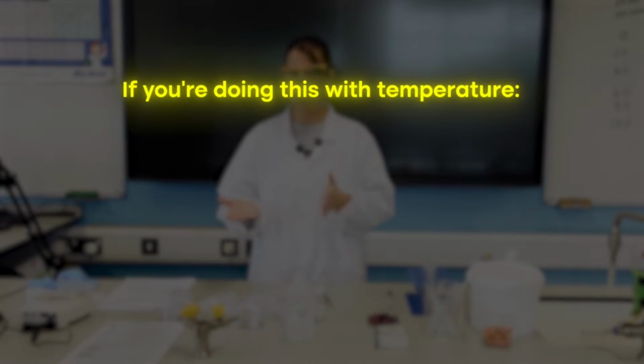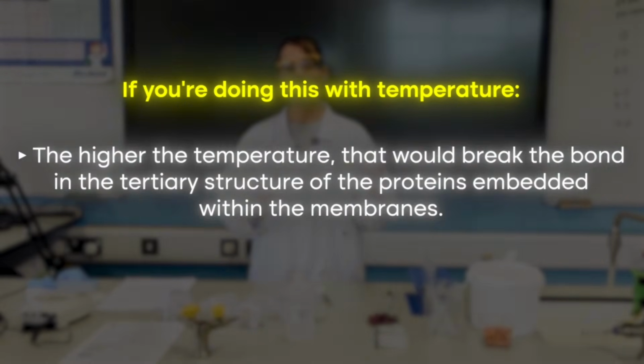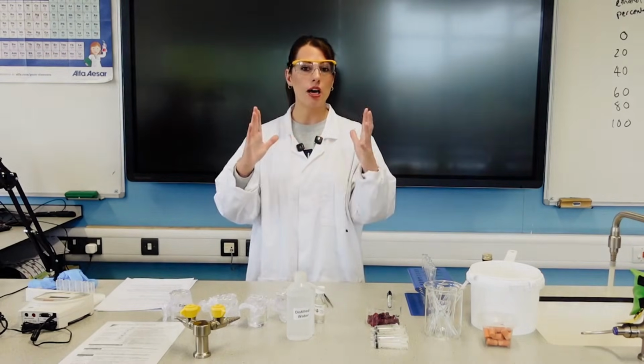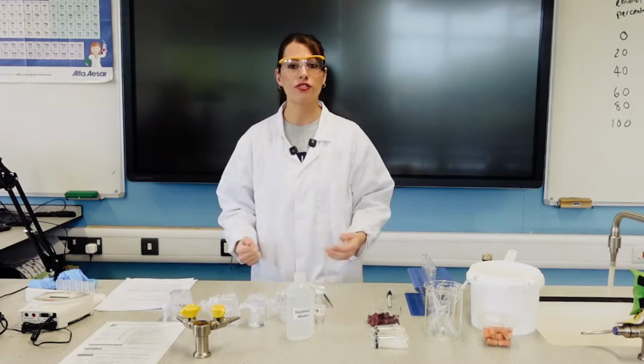If you were doing this with temperature, then the higher temperature would break the bonds in the tertiary structure of the proteins embedded within the membrane. So your channel proteins, for example, and that would then mean the channel proteins might be more open or permanently open, so more pigment can diffuse out.